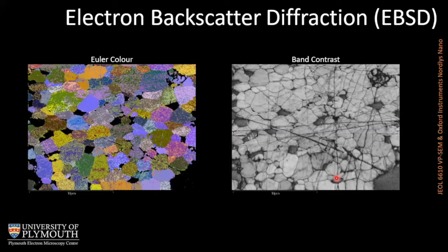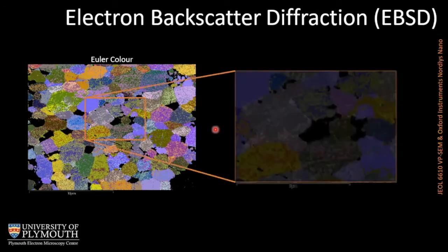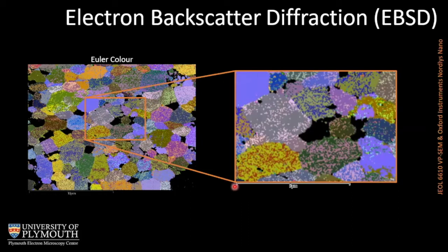On the left-hand side we have a typical electron backscatter diffraction map showing a very mottled effect — deliberately chosen to show that sometimes the data is not entirely confident. On the right-hand side is a black-and-white band contrast image: bright areas indicate good data where the EBSP patterns are really confident, and black areas indicate poor data where the bands haven't been resolved. Comparing the band contrast image to the Euler color map on the left, the black areas correspond to depressions in the sample, while the colors show many different grain orientations.